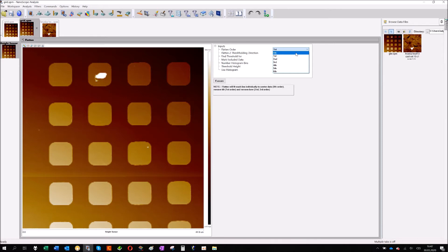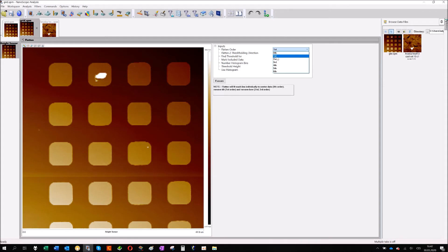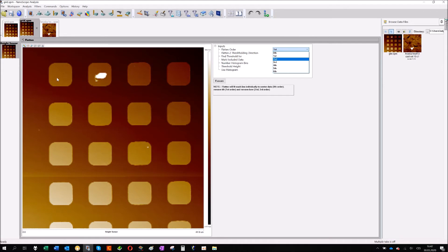That's the average, but we need to compensate the tilt. That's the first order. You fit a line which is straight, but on one side of the image has a different position than on the other side. Just because you have a line which is slightly going up or down. That's the first order. You just fit the line and then move the line back to zero under all positions.